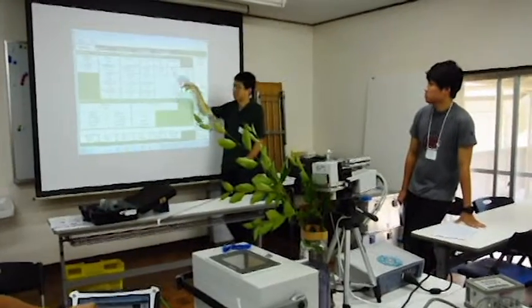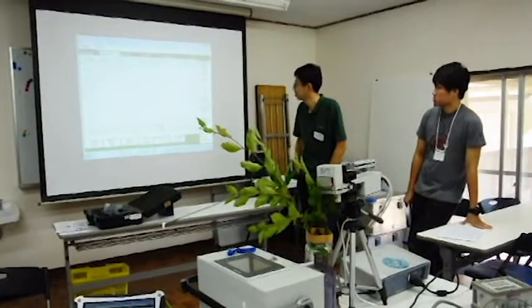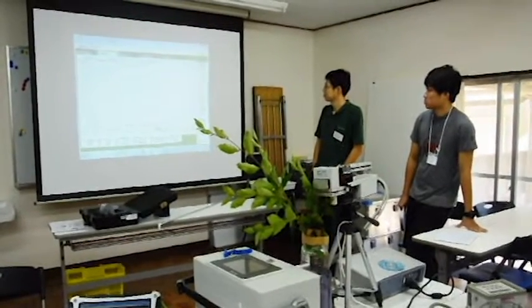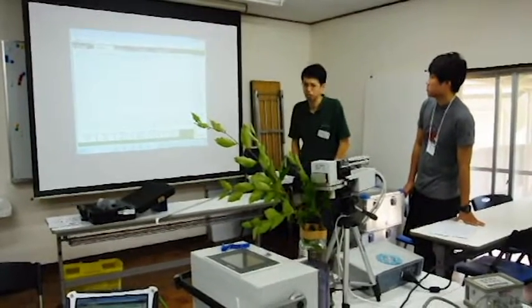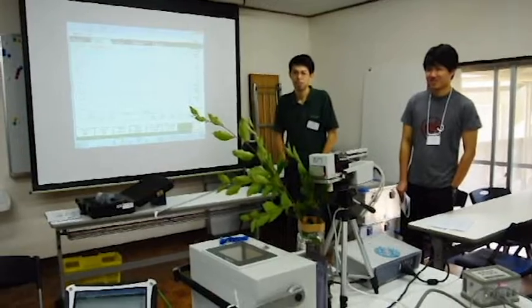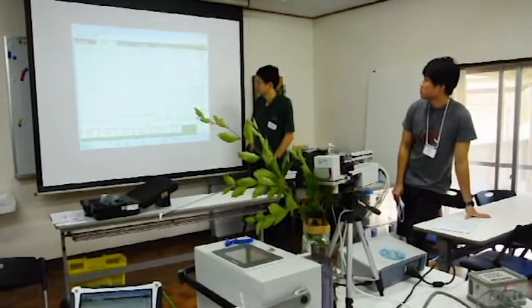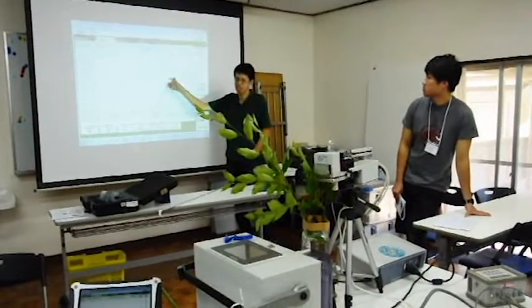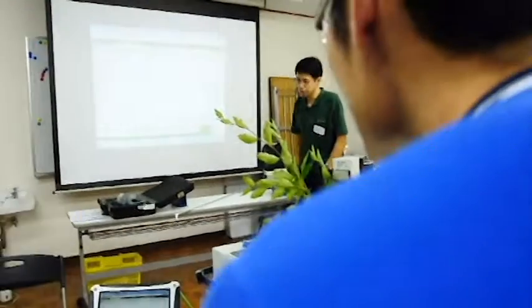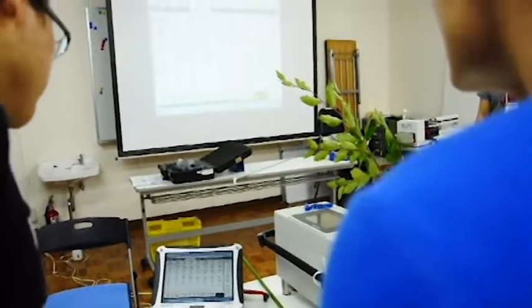Okay. If the stomata are more open, the photosynthesis rate will increase more sharply. Okay? Now, photosynthesis rate is increasing and increasing. Okay, please change the light level to 1000. The increasing value is monitored by this system.